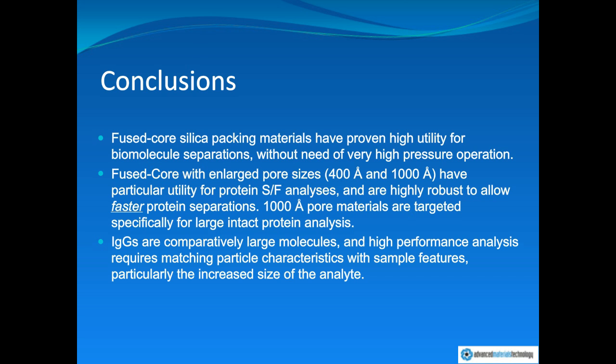There's been a lot of focus in this discussion today on IgGs. These are large and complex molecules, and you need all the help you can get for high-performance separations and characterization of, in the case of IgG2, these rather complex mixtures of variants. That's best achieved by making sure that you have sufficient pore size and appropriate particle morphology.